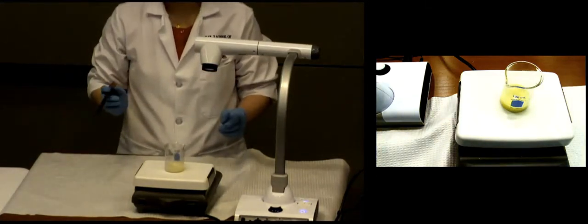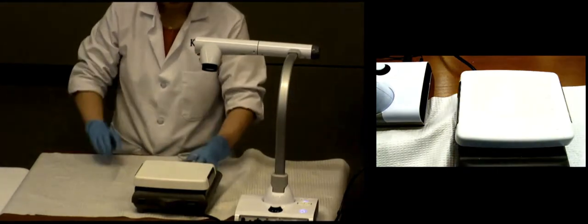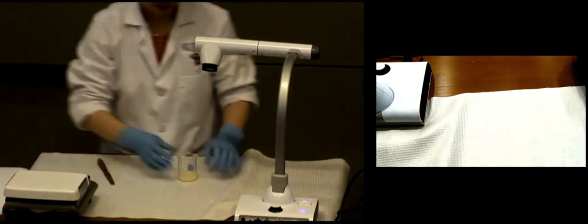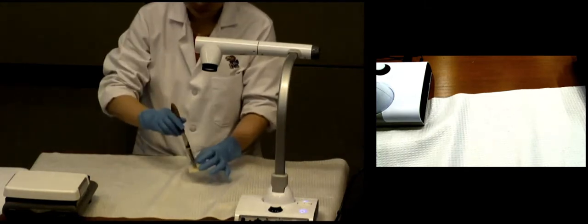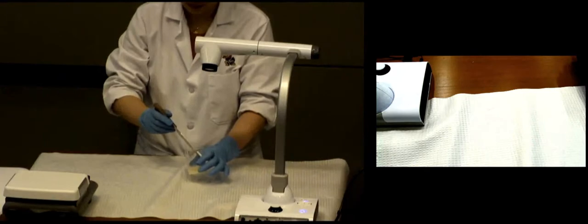Now what we'll do? We are ready to carefully remove the beaker and the product from the heat source, place it on the countertop, and begin stirring continuously with a glass rod, allowing the mixture to cool for just a couple of minutes until you can hold it comfortably by placing it on the palm of your hand on the bottom. So all right, if it's so hot it goes out, that would be too hot.